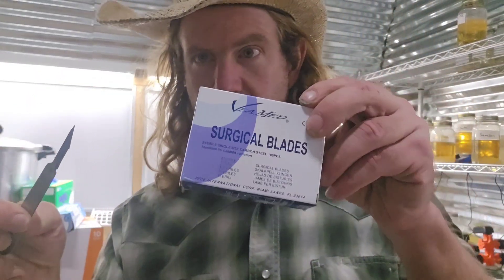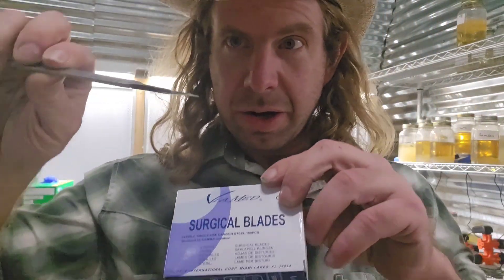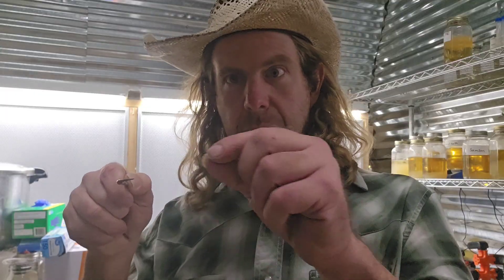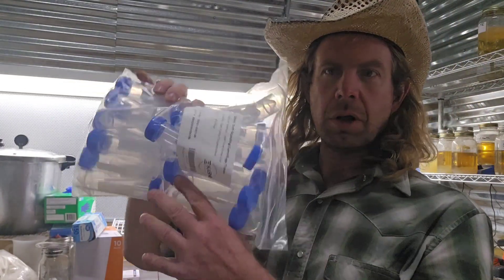Number twenty-two: scalpel — and some extra surgical blades. My dad always said every good man's always got a knife and a tape measure. Number twenty-two: scalpel. Number twenty-three: dental picks or a little hook. These are great for cloning or for picking up a syringe cap to put on your syringe when you're capping up some liquid culture. One of my favorite tools right here — number twenty-three: the dental pick or the hook.